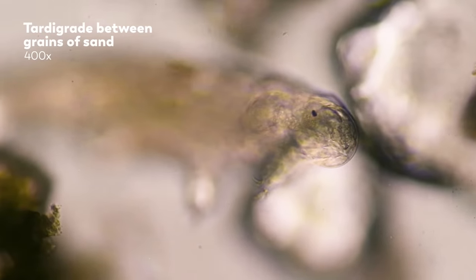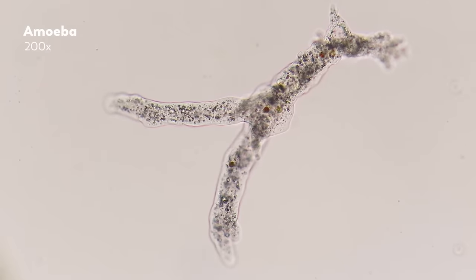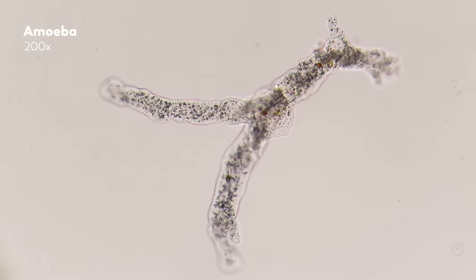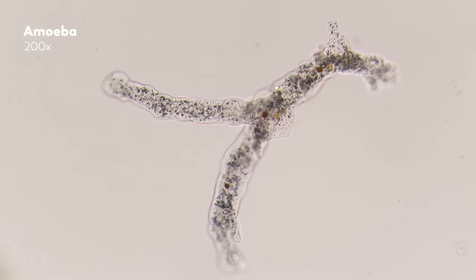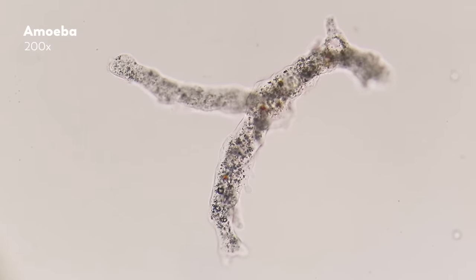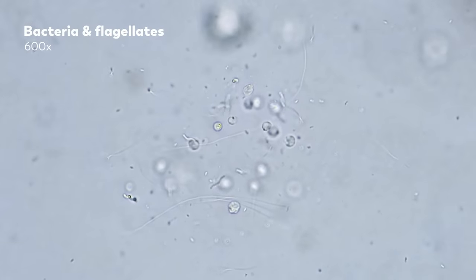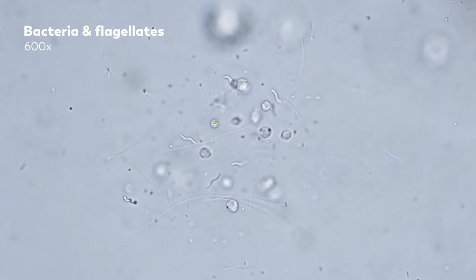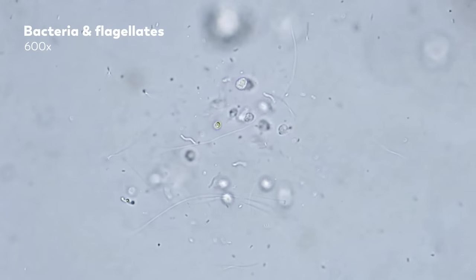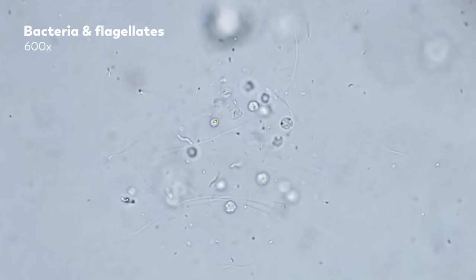Our microscope also shapes the way we observe the color of these organisms — more often, what seems to be the lack thereof. We've been asked why so many of them are transparent. Transparency comes down to two things: first, how much light there is, and second, how much stuff there is blocking that light. In the case of microscopic observation, there is a lot of light, and the bodies are tiny. Some of these organisms just lack the pigments that would make them colorful. But for others, the light source in the microscope is just too strong, overpowering their pigments so they appear, to our eyes, transparent. And you would be transparent too, if you are only a few microns thick.